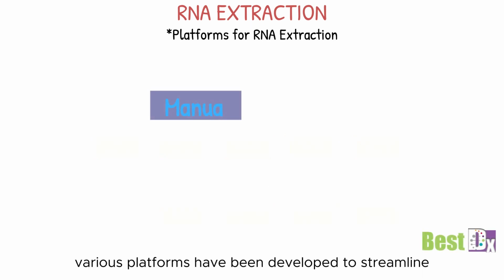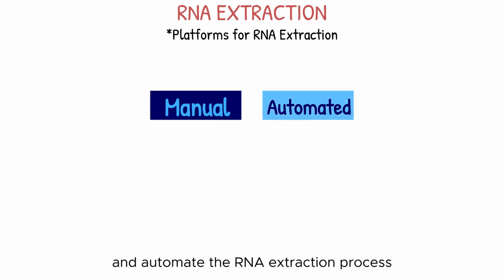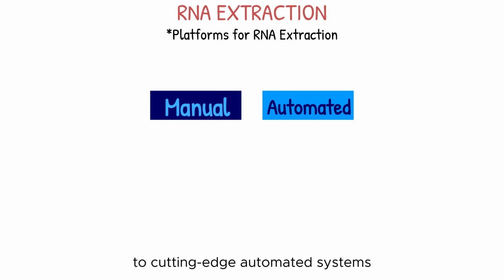Over the years, various platforms have been developed to streamline and automate the RNA extraction process. These platforms range from traditional manual methods to cutting-edge automated systems. Let's explore some of these options.